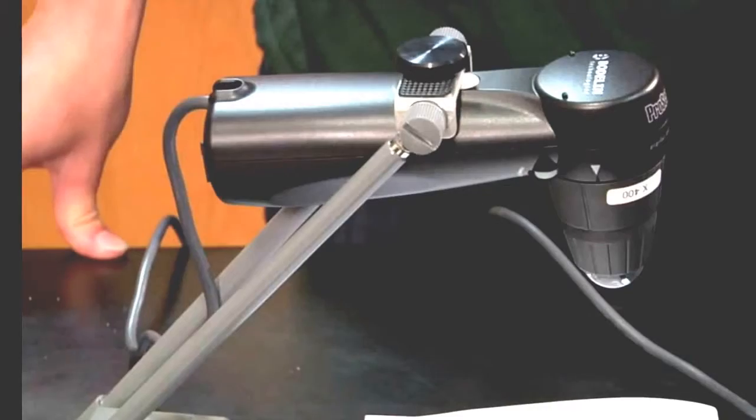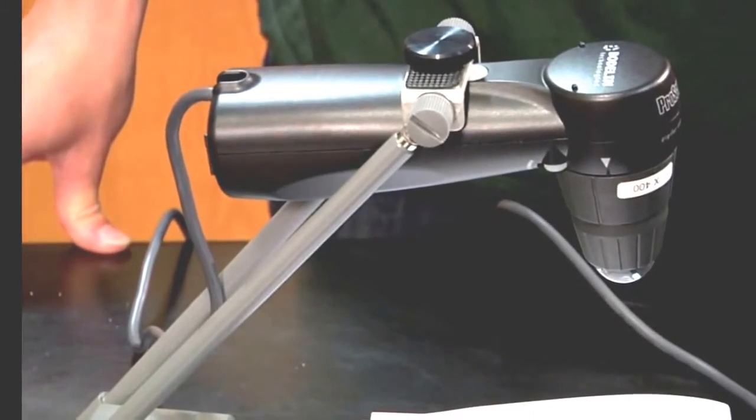In this lesson, you will learn the basics of visual identification of hair and fiber evidence. We're going to be talking about the different shapes and patterns of hairs and fibers and how to analyze these microscopically. I'm going to be showing you some examples of microscopic images using a ProScope HR digital microscope, which links the images directly to my computer screen. This piece of equipment is commonly used by forensic scientists.